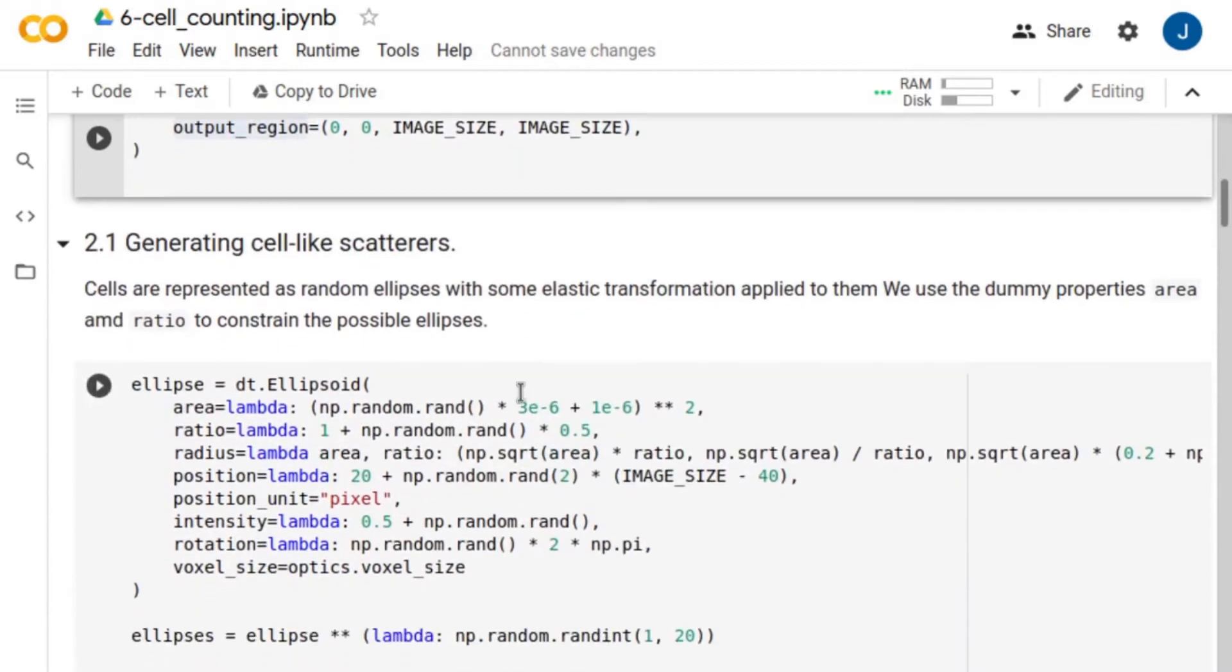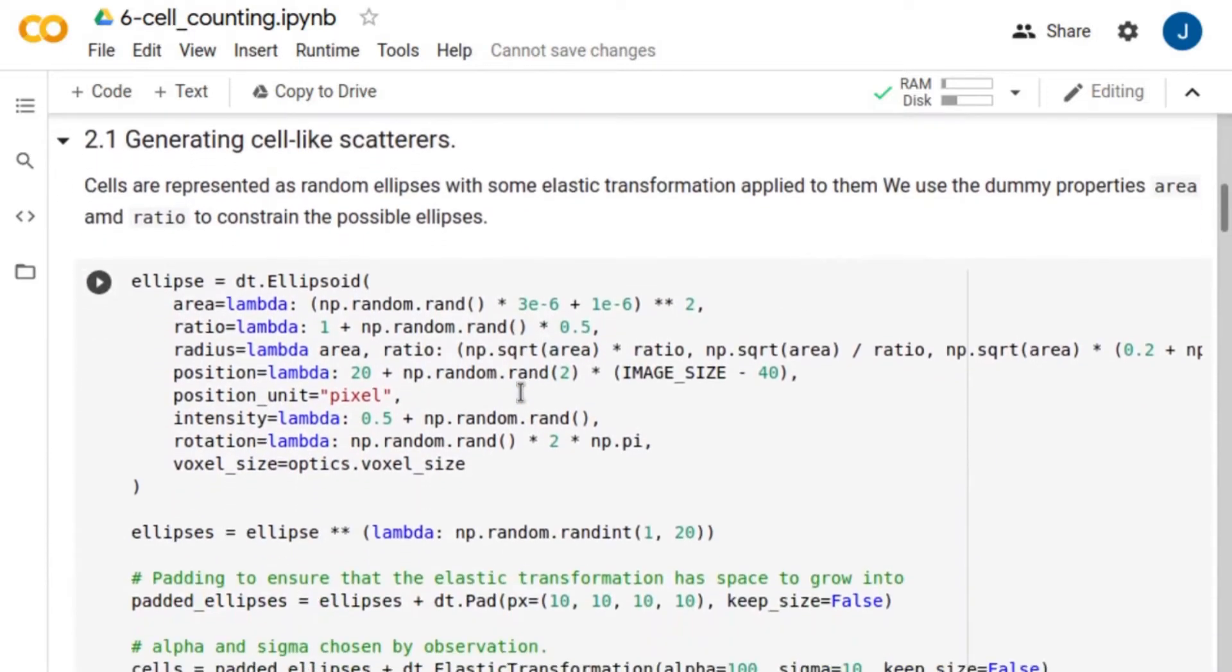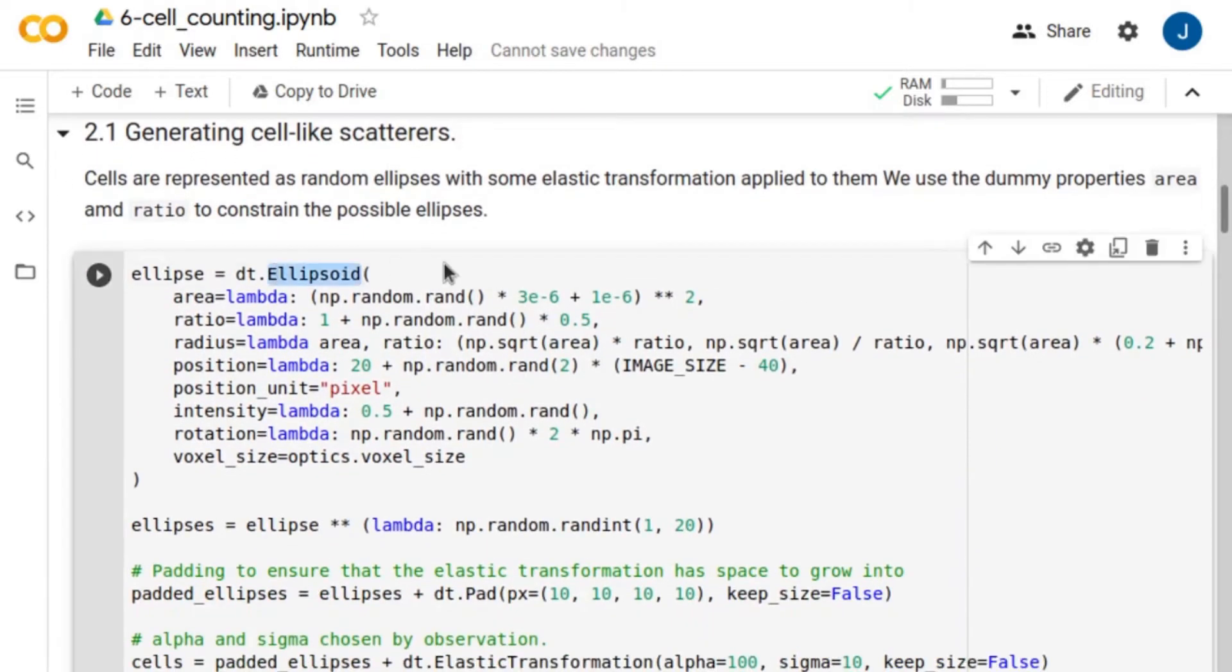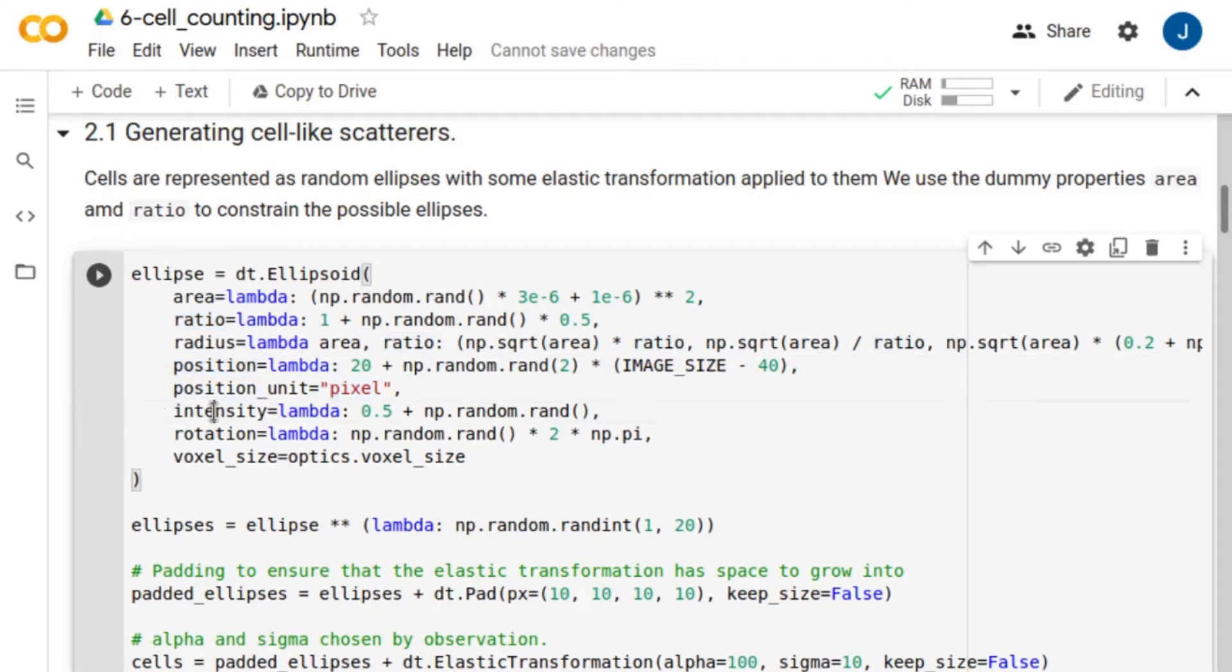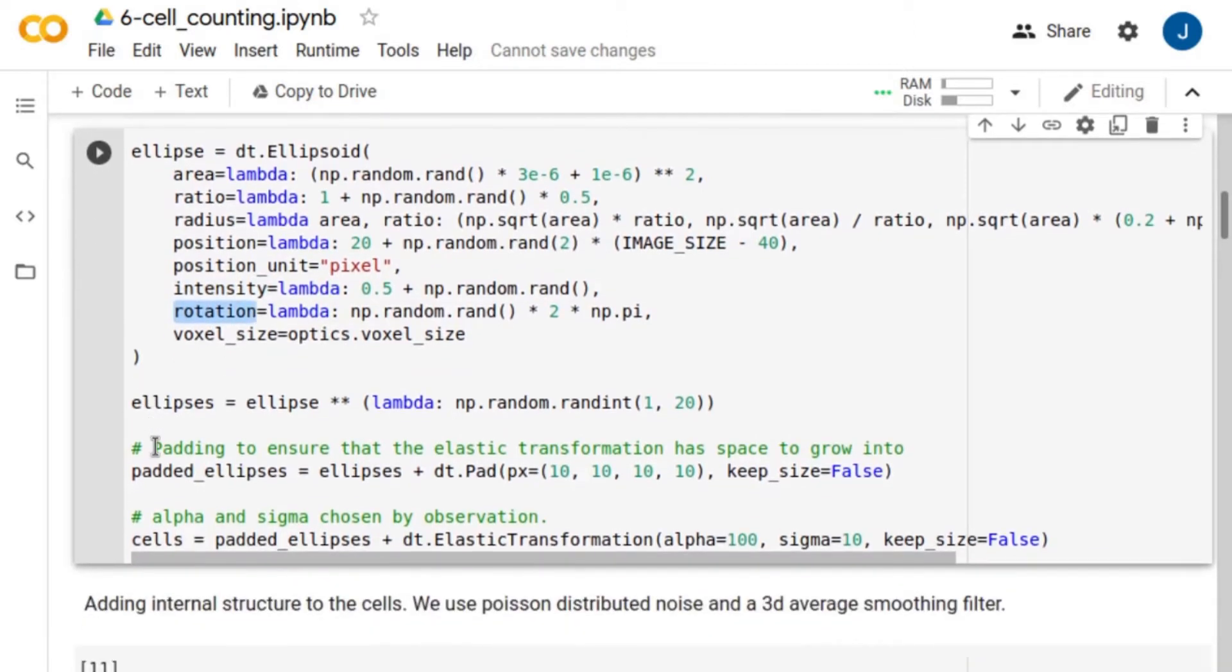We simulate the cells as random ellipses. The radius of the particles are defined in terms of the dummy properties, area and ratio. Then, we define the particle position in pixel units. The cells are also given an intensity and rotation. And the number of cells is set randomly between 1 and 20 per image.